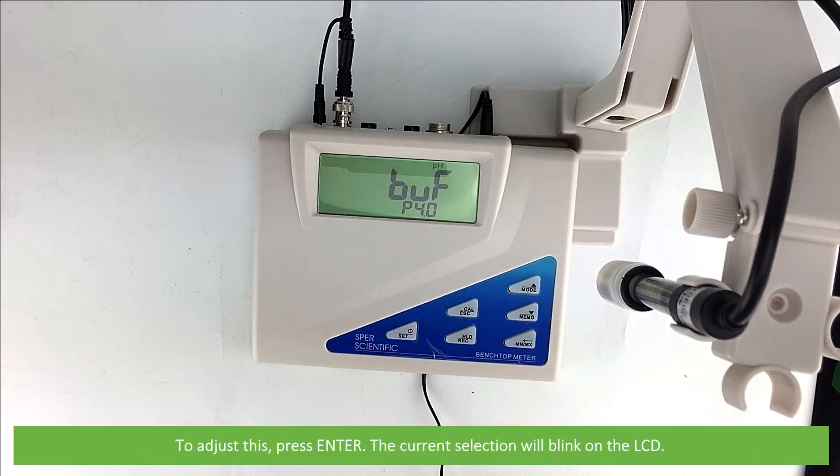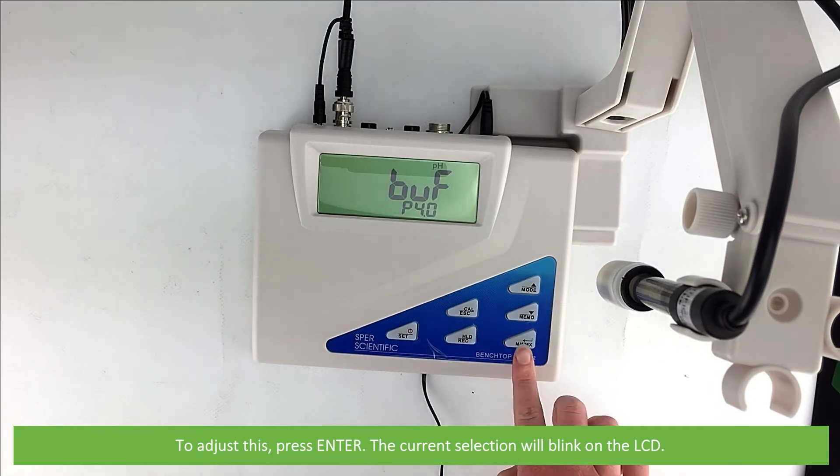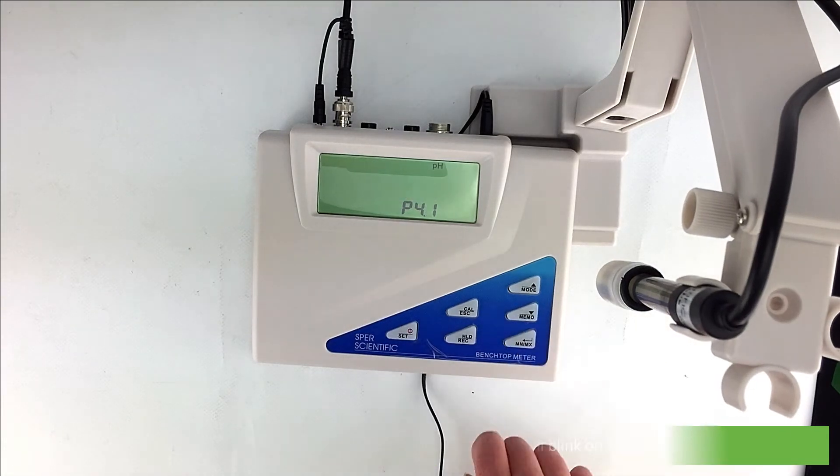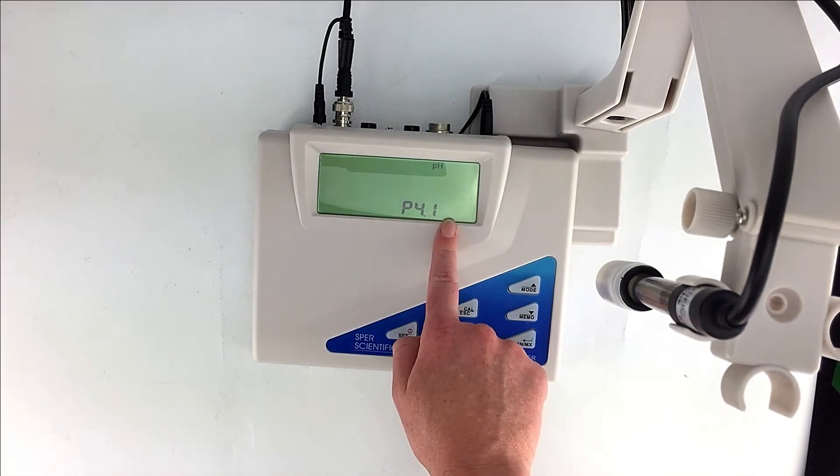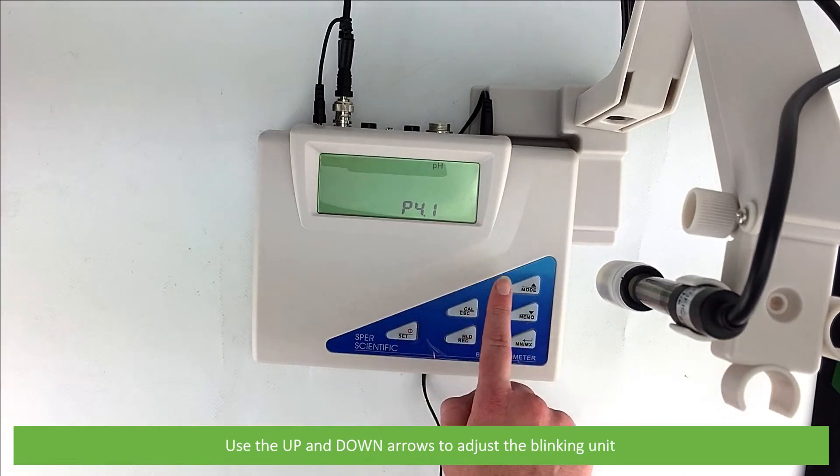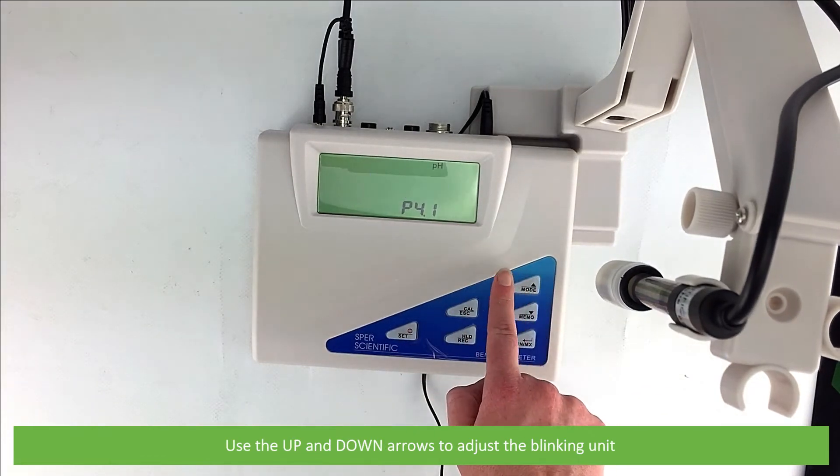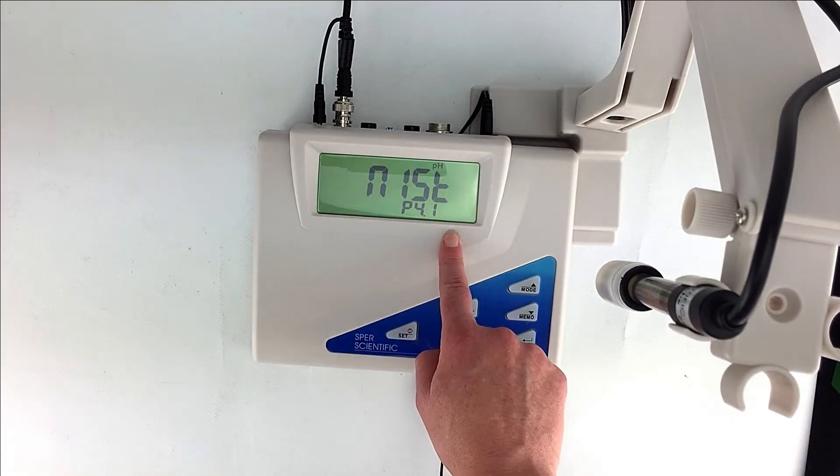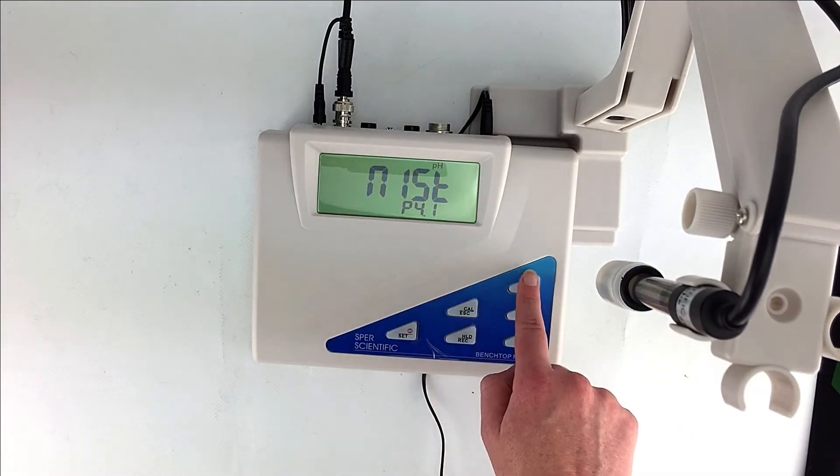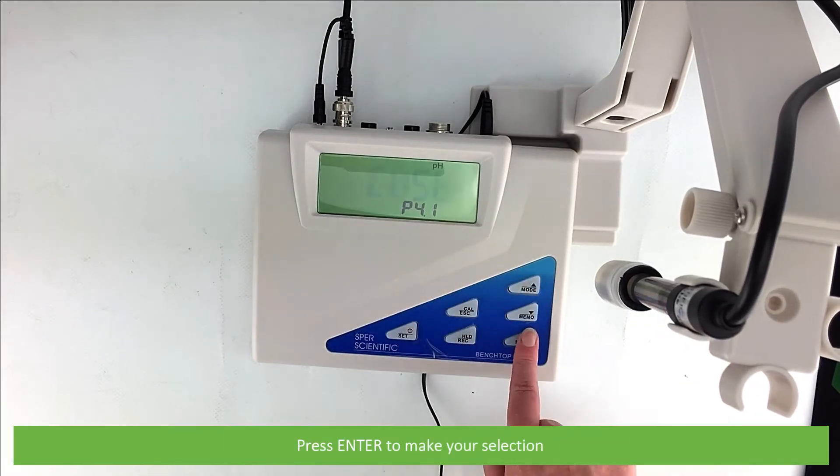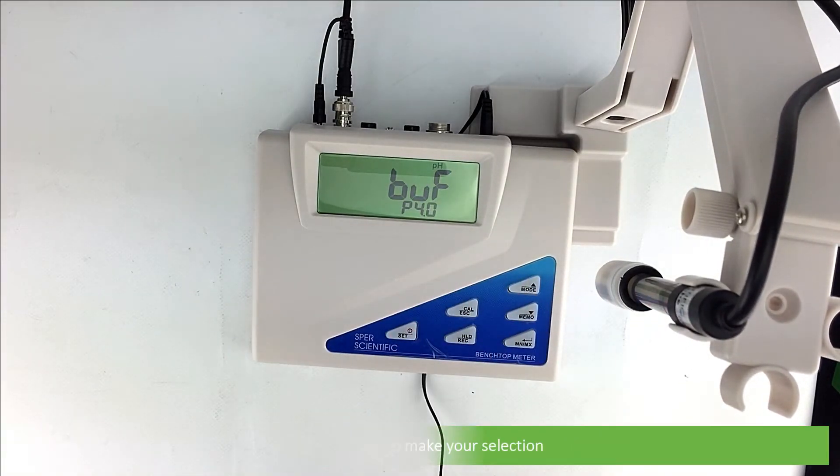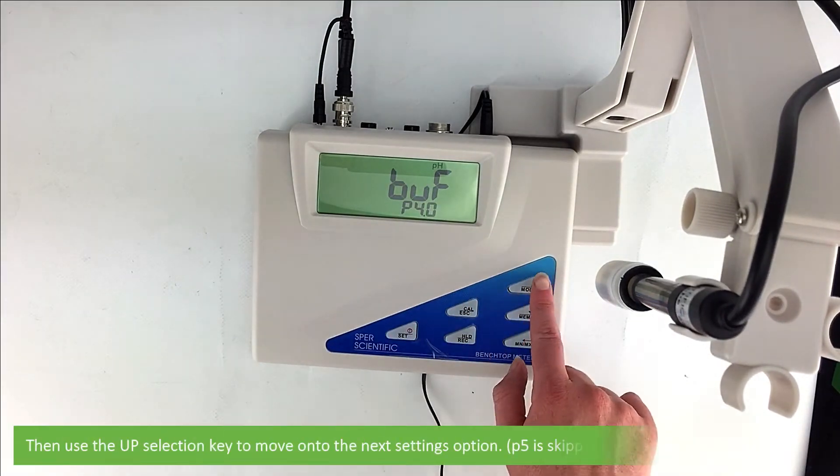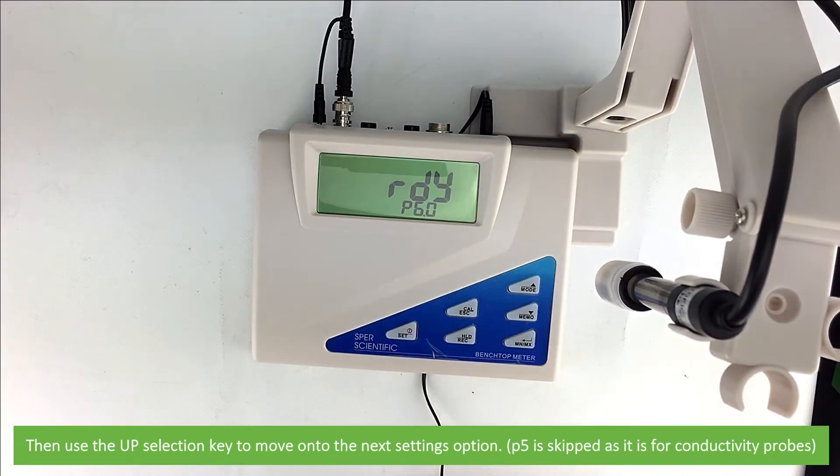To adjust this press enter. The current selection blinks on the LCD. Use the up and down arrows to adjust the blinking unit. Press enter to make your selection. Then use the up selection key to move on to the next settings option.